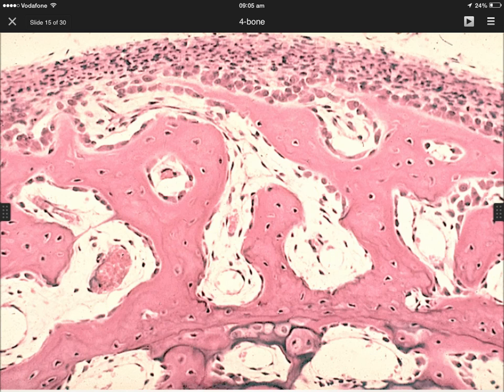In the bony trabeculae, on the surface, as you see, we have dark oval cells, free, not imprisoned in matrix, so they are called osteoblasts. And inside the bony trabeculae itself, we have imprisoned cells. They are the osteocytes, which are responsible for the maintenance of the bone, and this is for building of the bone. Also, in the bone marrow cavity, you can see these blood vessels and these hemopoietic cells responsible for the production of the different blood cells.